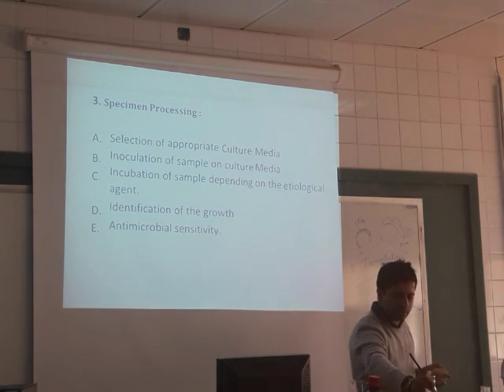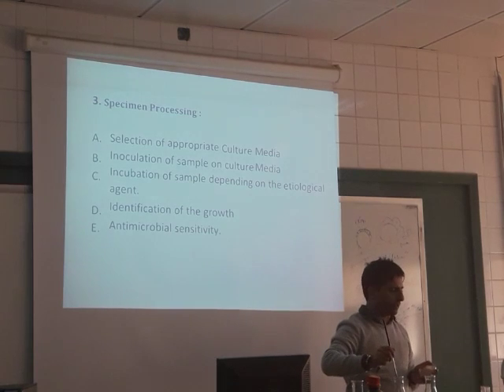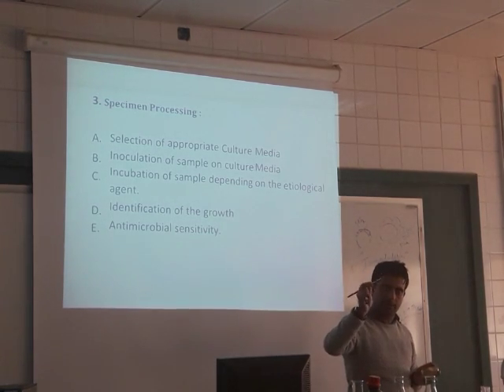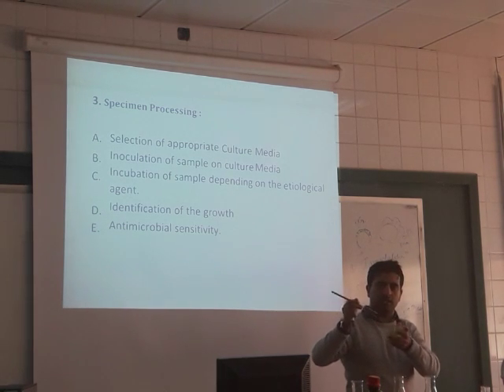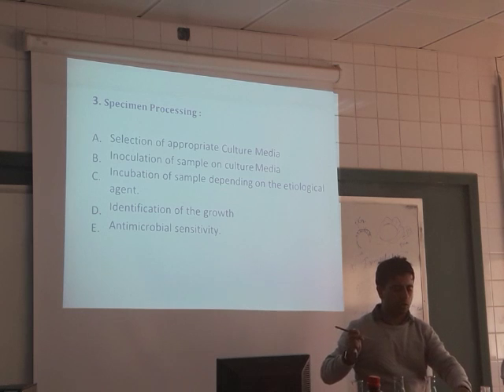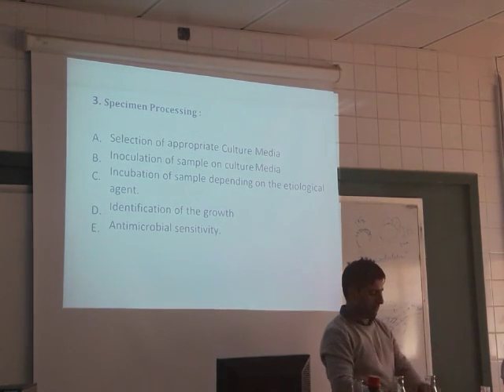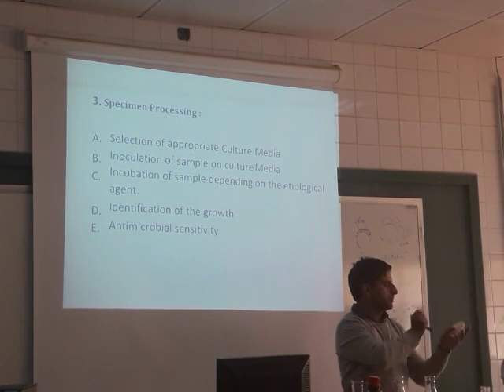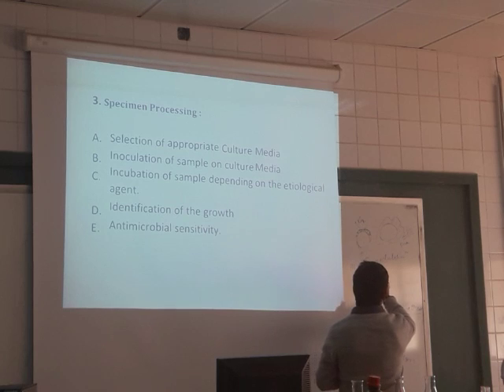For example, I am having here a sample of urine. I will pick the loop and insert it and do like this. I will pick some of the urine and put it here like this. This is called inoculation. And I will just put it here. Super. This is called inoculation. And then I will do incubation.